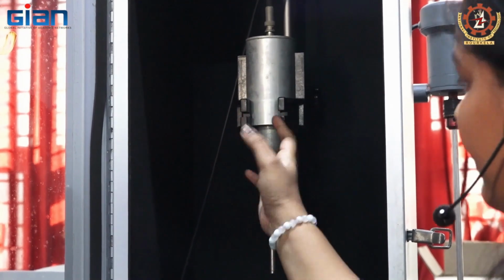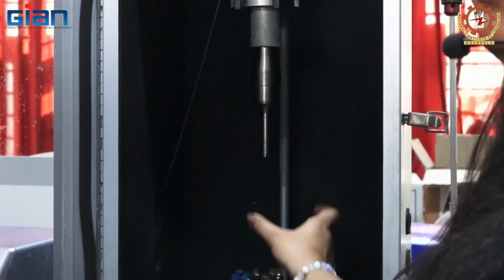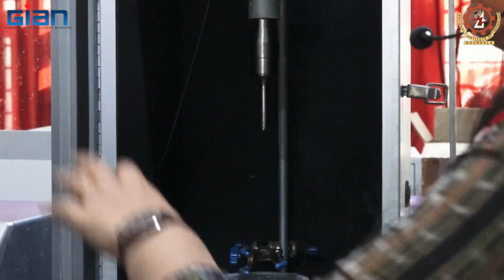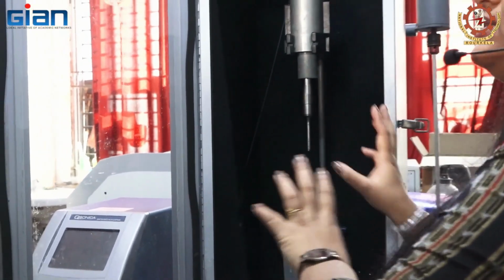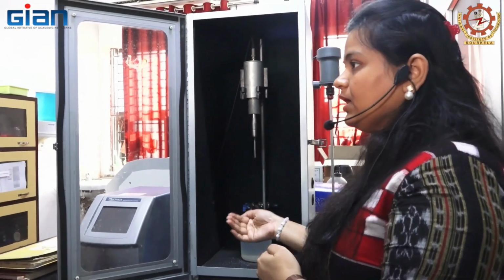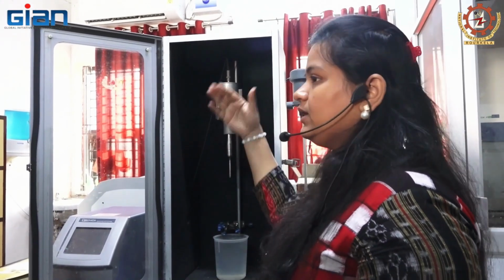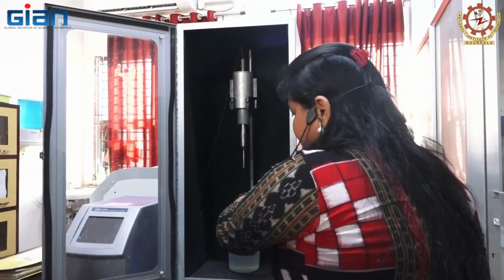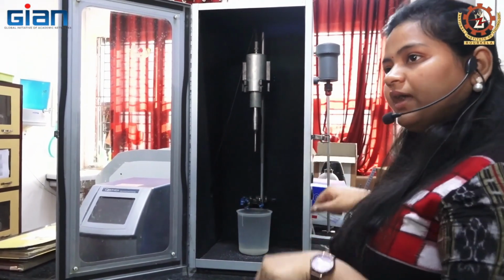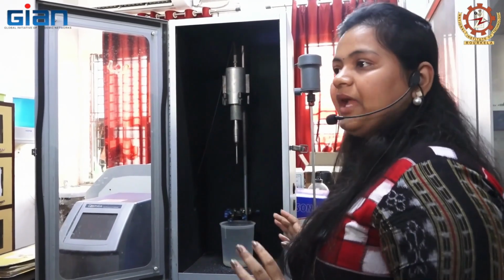Then it will pass through the probes, which are in direct contact with the vessels. And then we command the generator that this amplitude at this time we will give for the extraction. Then it will convert the ultrasonic wave and pass through the probes, and from the probes it will go to the extraction vessels. At this time the extraction will happen.